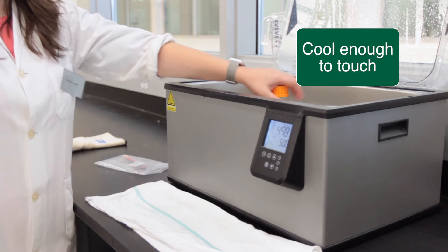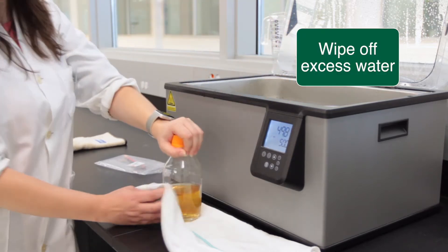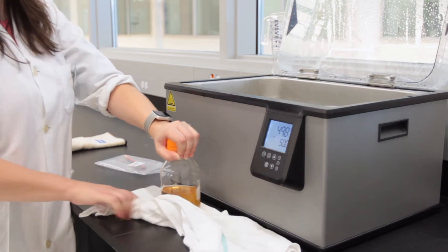When you approach the water bath you have to grab the bottle, make sure that it's cool enough to touch, and wipe off the water from the water bath so you can take it back to your bench to pour plates.